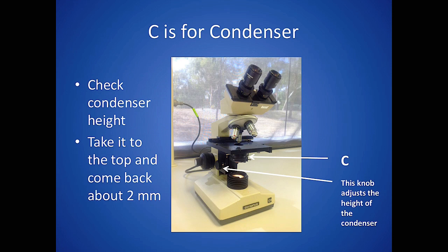C is for condenser, and it's very important to have the condenser at the right height. Generally speaking, you can rack the condenser all the way up towards the stage and then just back it off about two millimeters. That's approximately the right height if you're not using Köhler illumination.